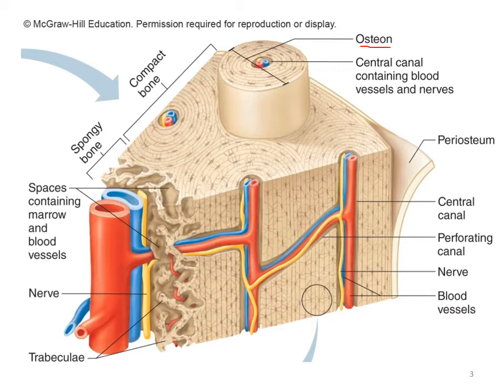So we've got all of these layers, these lamella, and in between those layers we find these little cells called osteocytes. Now on this picture it looks like a whole bunch of little ants. Most students agree with me. Most students will say they look like little bugs all over this. They are the actual bone cells and they're called osteocytes.